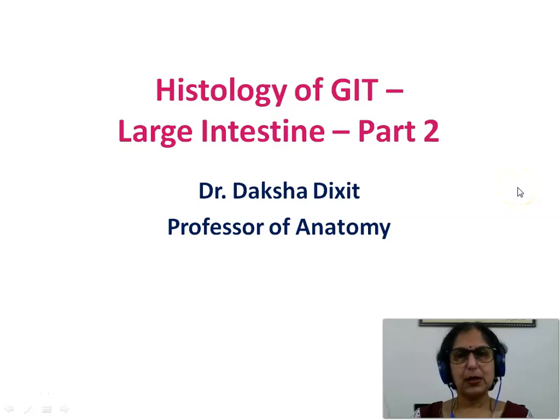Hello students, today we will be seeing Histology of GIT, Large Intestine, Part 2. In the video of Large Intestine Part 1, we had seen the general features of histology and gross anatomy of large intestine, and we studied one important slide, and that was of histology of colon. In the video today, we will be studying the other important slide of large intestine, that is histology of vermiform appendix, and we will then be seeing how to differentiate between small intestine and large intestine.